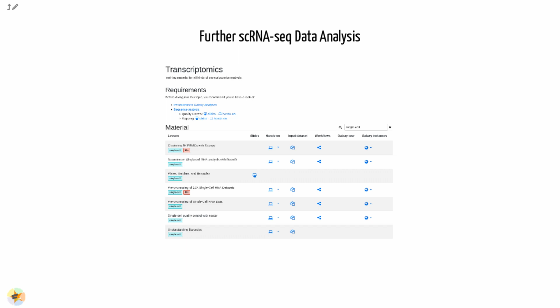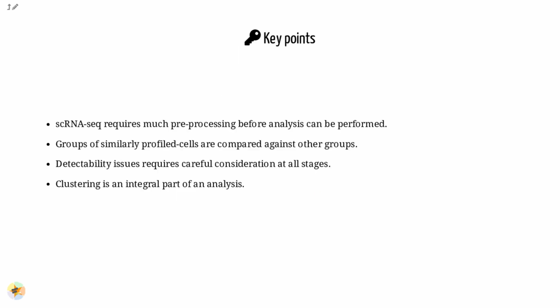scRNA-seq requires much pre-processing before analysis can be performed. Groups of similarly profiled cells are compared against other groups. Detectability issues require careful consideration at all stages. Clustering is an integral part of an analysis.